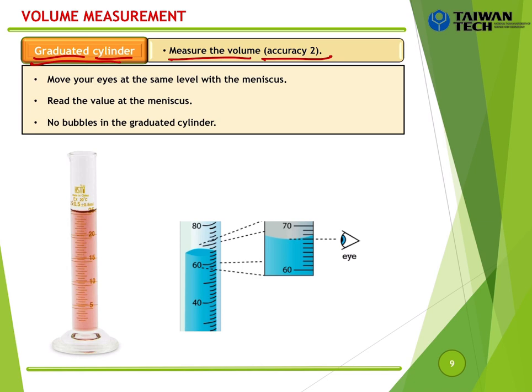And from here you can see in our tool, the graduated cylinder, they may provide you the value for the total volume we have. The figure here may not put the number in every place, but you can see the maximum one, 25. And you can also check the unit. So you see from here we have 25 milliliter. This one is the maximum volume of the cylinder we can use. Okay, and from here they also make it into levels. So you can see this one is 5, this one is 10, 15, 20, and 25.